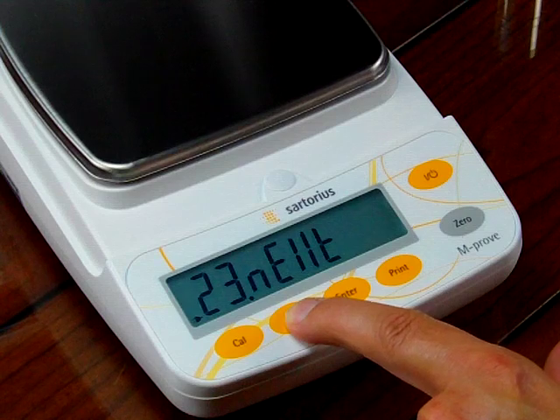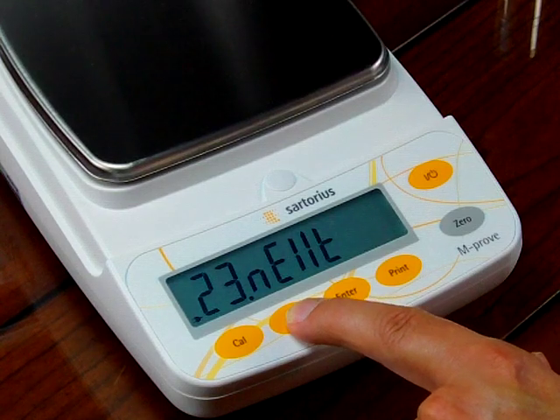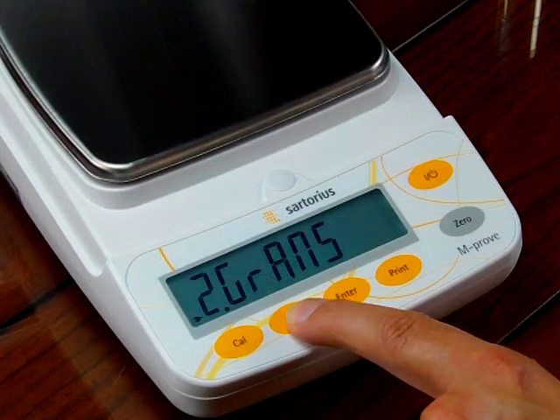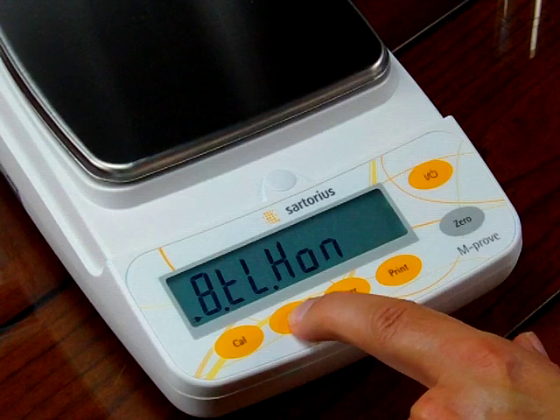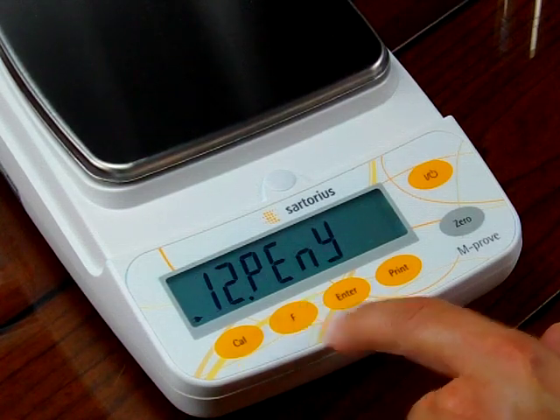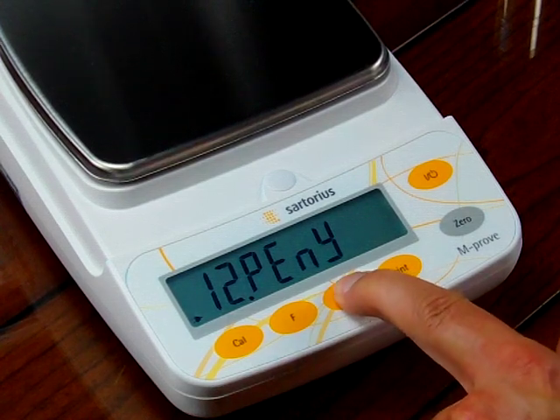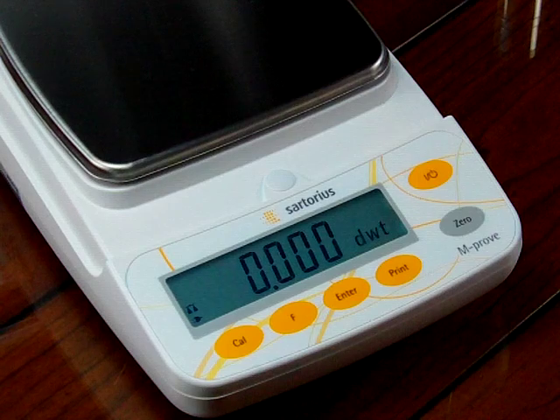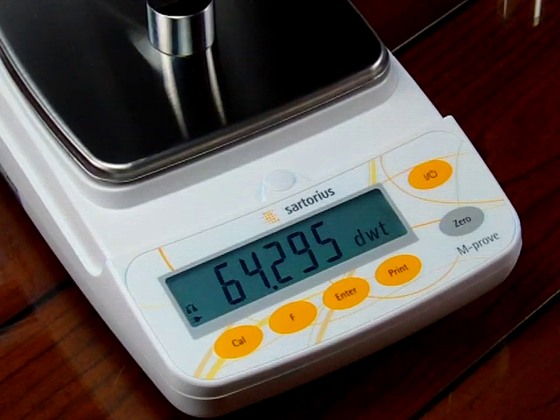Let's say you're a jeweler and you want to weigh in grams and penny weight. The default is always grams as the primary mode. We'll set it up so the secondary mode will be penny weight. Navigating to penny weight, we now have it selected and need to store this value by pressing and holding the enter key. The balance is now in penny weight — 100 grams is equivalent to 64.295 penny weight.